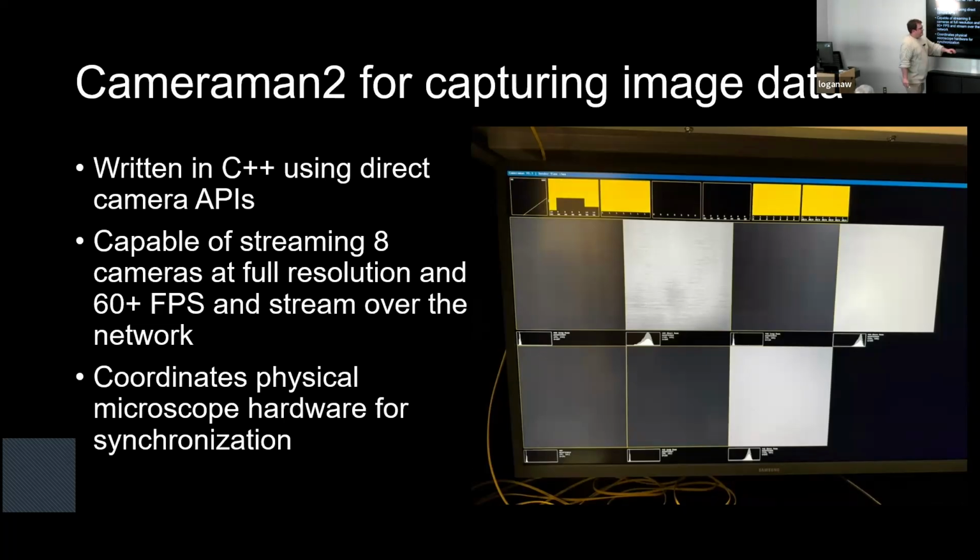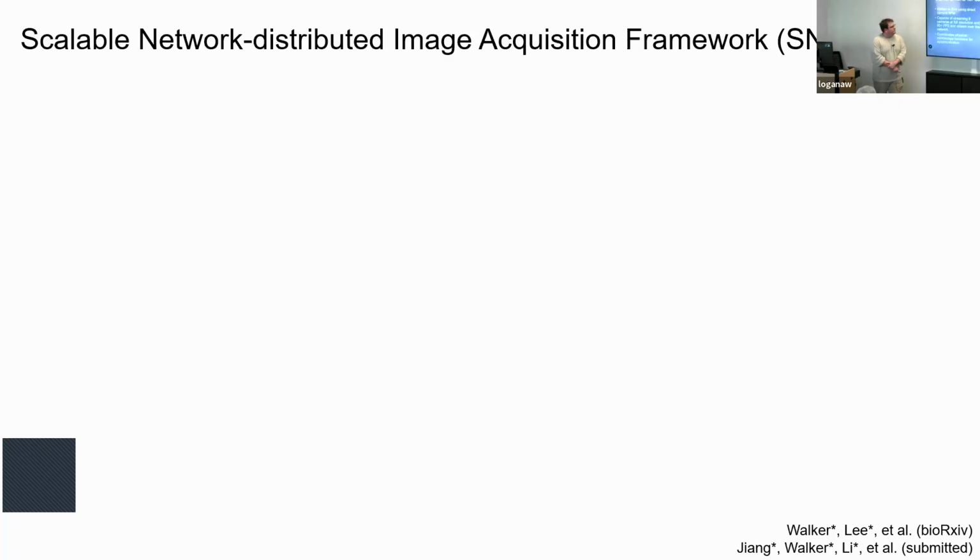Each one of these cameras is 3,200 by 3,200 pixels. So this is pushing thousands and thousands of pixels through the screen at once. It's all GPU accelerated with live image compression, so that as the cameras collect individual images, it compresses them down and allows us to sort of churn through experiments as fast as possible.